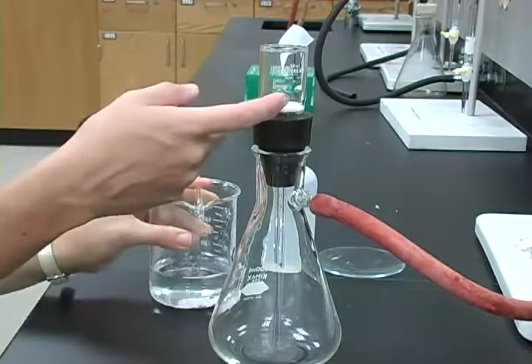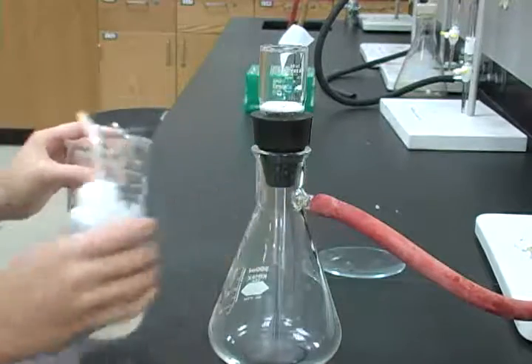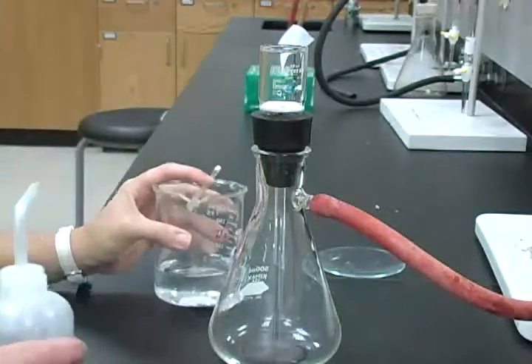Beaker matches with the corresponding crucible. These crucibles would need to have the empty constant mass known.